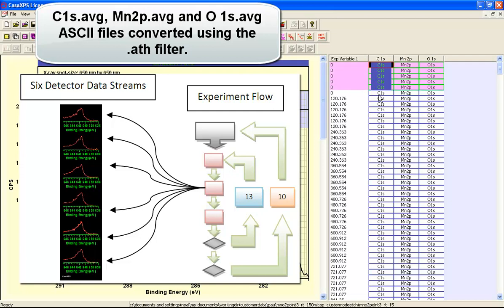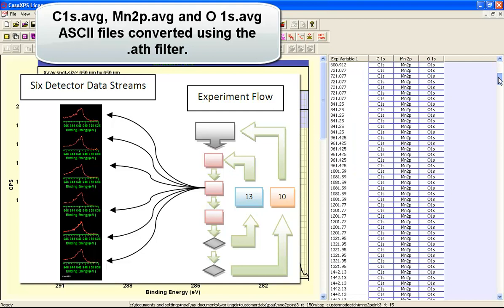So they were all assigned the same experimental variable. And this represents the etch time. So you can see this is the first etch cycle, second etch cycle, etc.